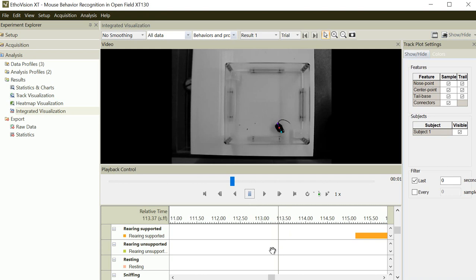And the nice thing about this software is that you have your cursor like this, like a hand, and this hand can grab like this.